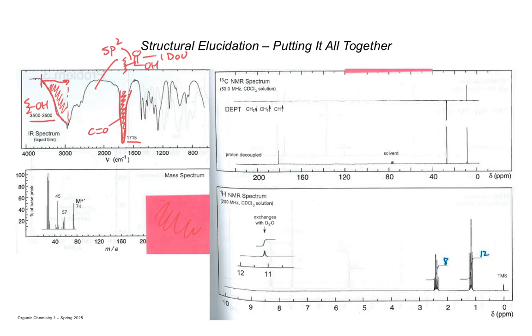So we're off to a start here. In the mass spec, see the parent ion M+, it says 74. That's an even number, so what can we say? There's no odd number of nitrogen atoms. The other thing you'll note, you don't really see any M+2.